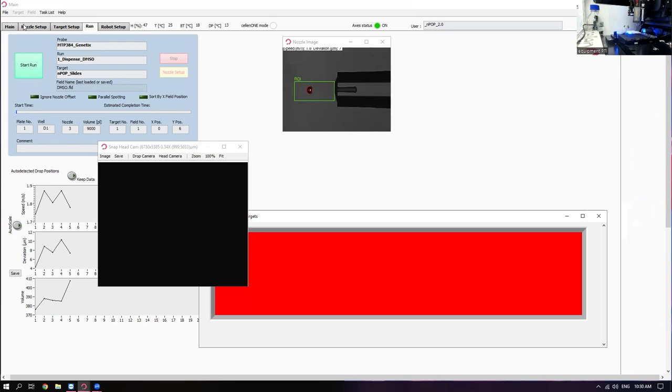They did some customizing, like they had their own bespoke solution for this tray here. But this was one that I found from another project a long time ago and have been integrating into this process. The slides were slides that we had for a long time. We did a lot of surface chemistry work, and I don't know that anyone found a good use for them. Then it just so happened, Nikolai was like, what kind of surfaces do you have? We're looking for something very hydrophobic. And this one ended up just fitting the bill.